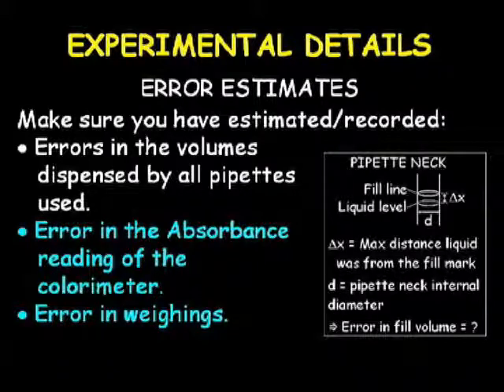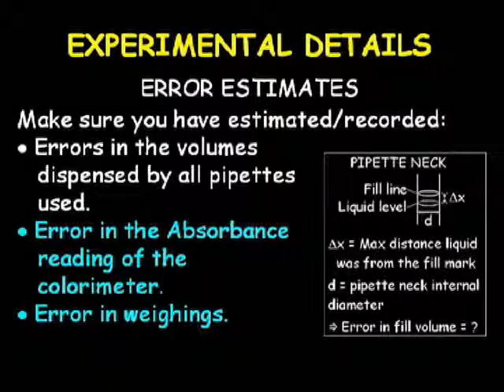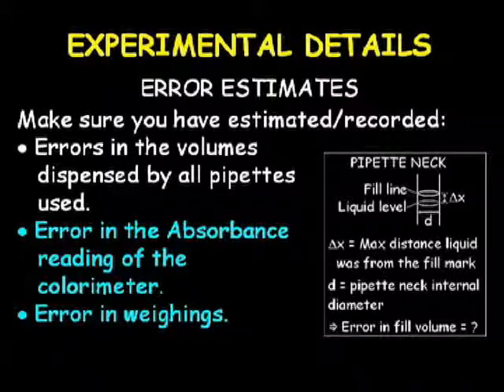The other errors that need to be established are those associated with the measured absorbances and weighings. Once again, refer to the errors video, which contains details of how to estimate errors on digital readouts.